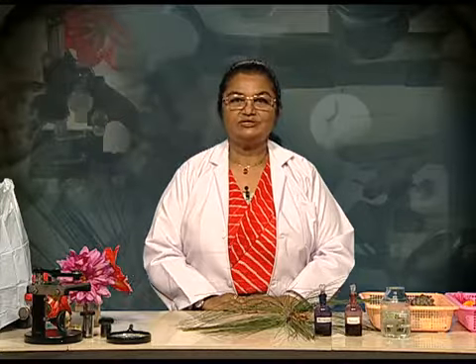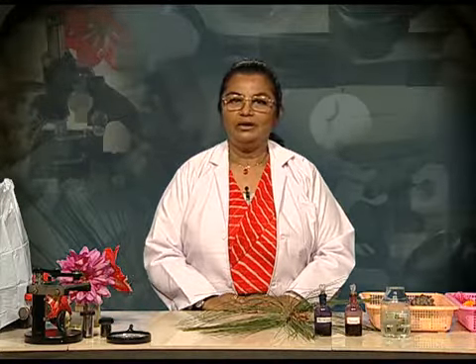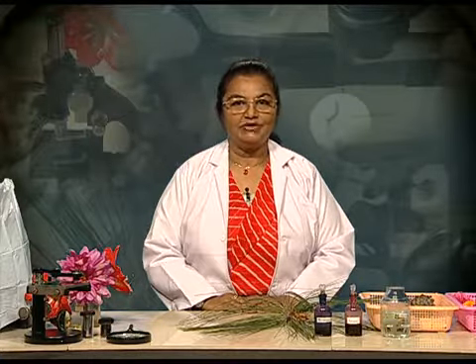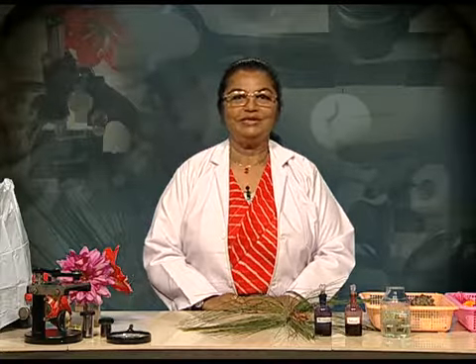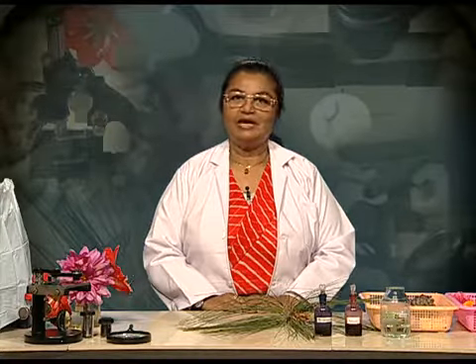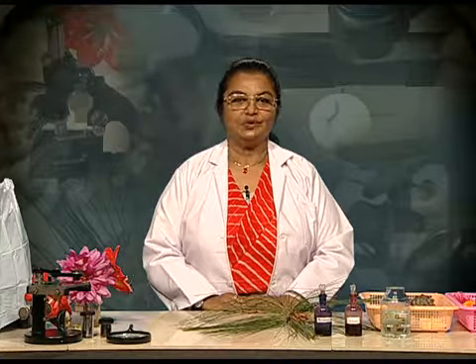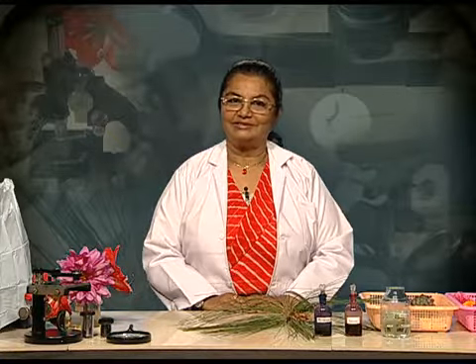Objects that are smaller than 0.1 millimeter are called microscopic things because we need a microscope to see them. By using a microscope, we can study the structure of cells, the tissues, the bacteria, and even the viruses. A peep into a microscope opens up a whole new world for us.